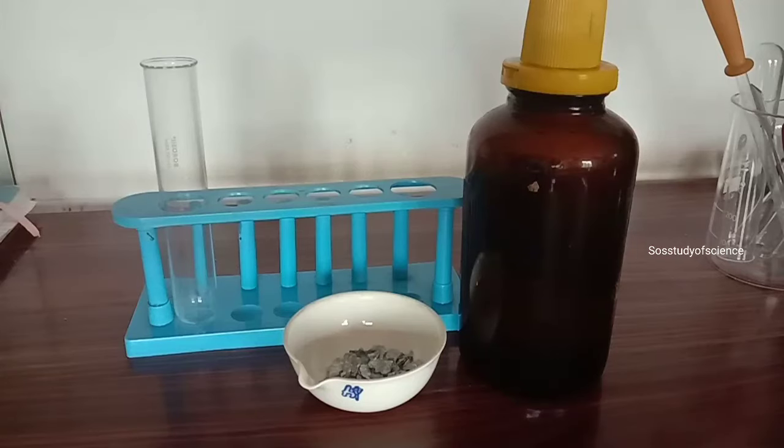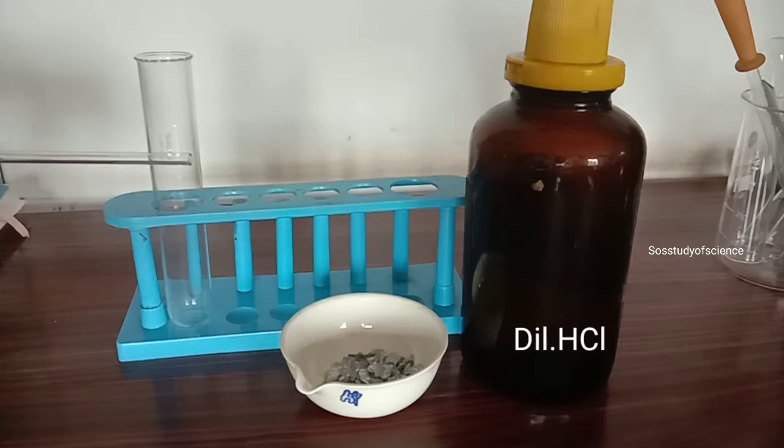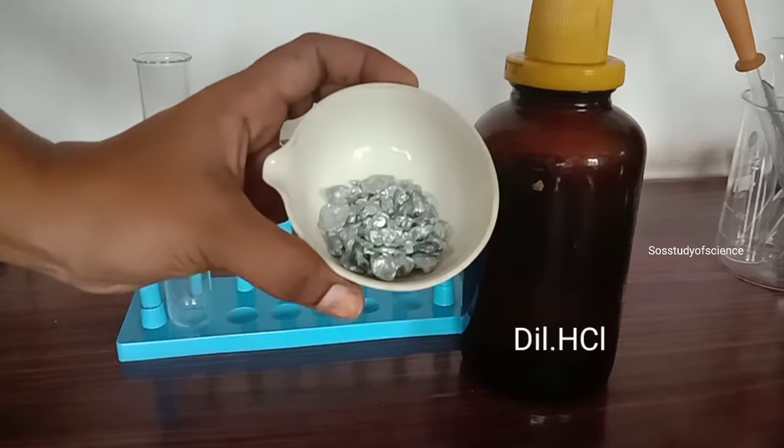Hello everyone, today I am demonstrating an activity to show how does the metal react with acid. To demonstrate this activity, you need dilute hydrochloric acid, a test tube and a metal. The metal which I have chosen here is zinc.